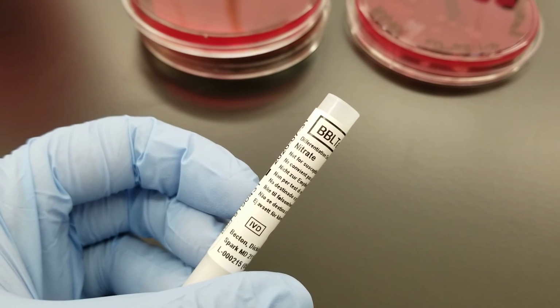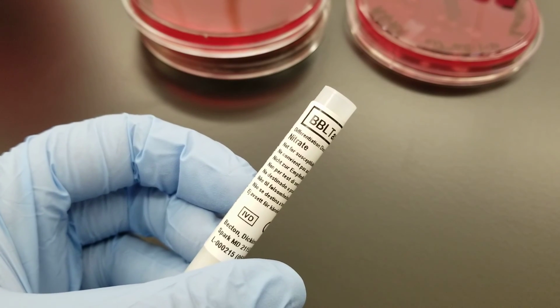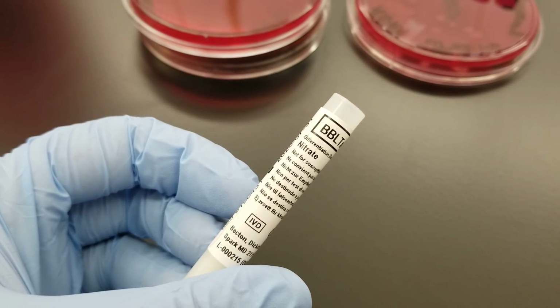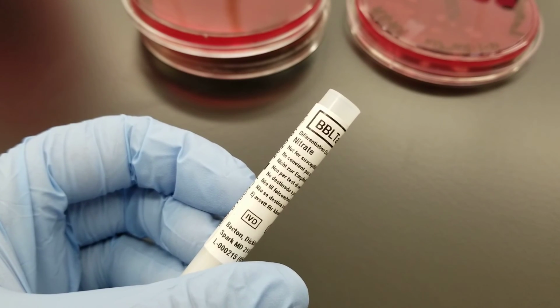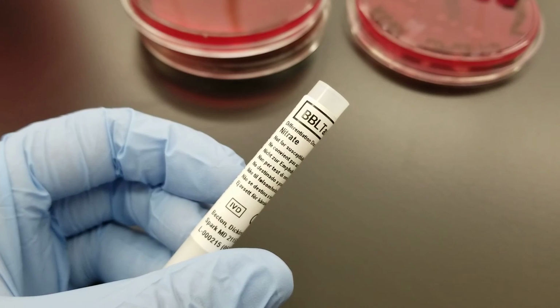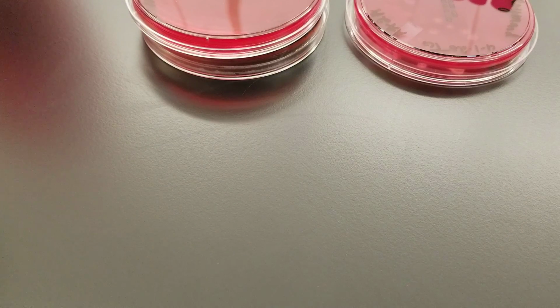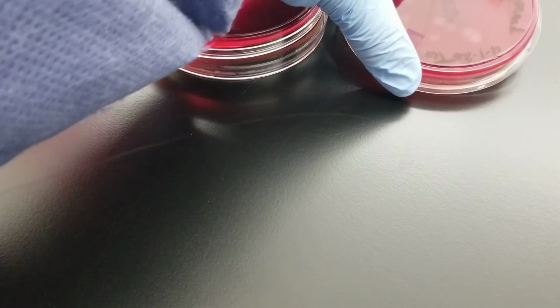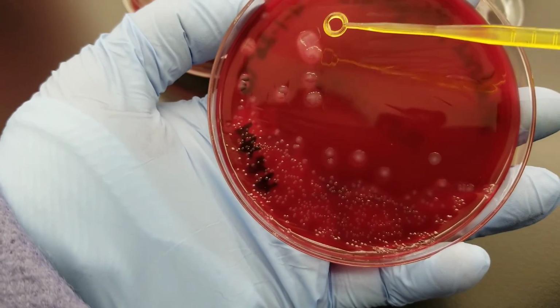Depending on whether you follow the insert or manufacturer, they might say first or second quadrant. Today I'm going to put it in the second quadrant. In another video it was on the first quadrant. It really just depends on what the manufacturer describes, or the textbook that you're following. The textbook that we have says the second quadrant, so I'm going to go with that so that if students look that up, they're going to be able to follow that procedure.